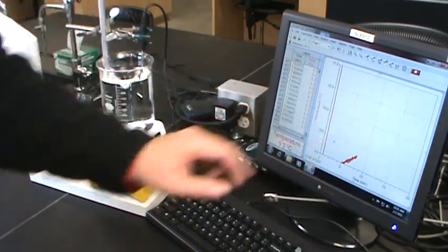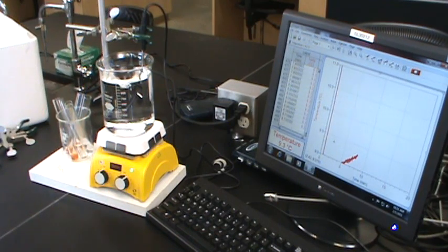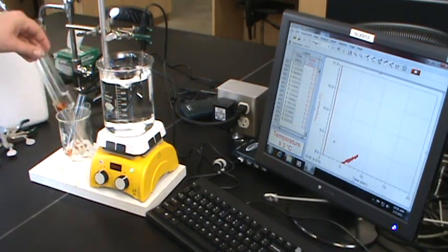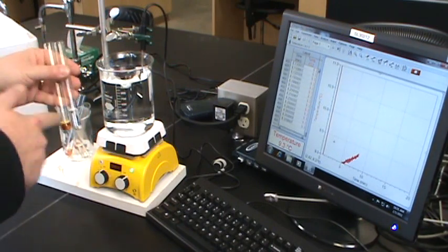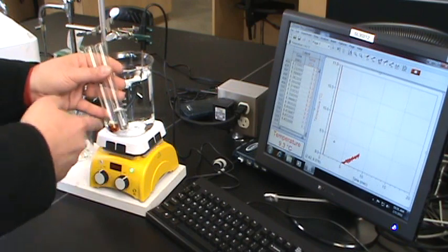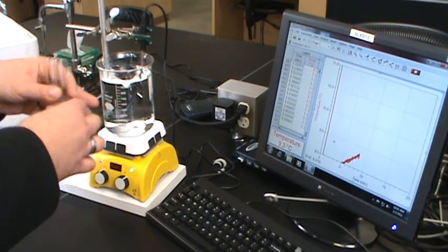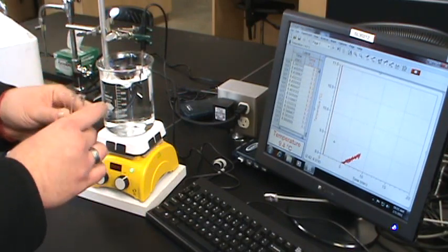I'm going to let this warm up a little bit more before I do an actual experiment. But the other thing that we have to do is equilibrate the temperature. Just like with the cold bath, I've got a few set up over here. If I mix these warm samples together and then cool them down, I'm not going to get the answers I'm looking for, because I need these to be at bath temperature before they get mixed.